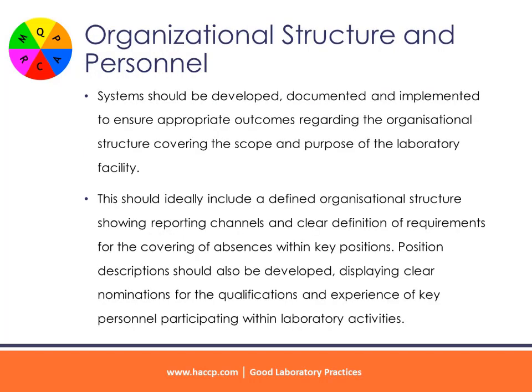Organizational structure and personnel. Systems should be developed, documented and implemented to ensure appropriate outcomes regarding the organizational structure covering the scope and purpose of the laboratory facility. This should ideally include a defined organizational structure showing reporting channels and clear definition of requirements for the covering of absences within key positions. Position descriptions should also be developed, displaying clear nominations for the qualifications and experience of key personnel participating within laboratory activities.